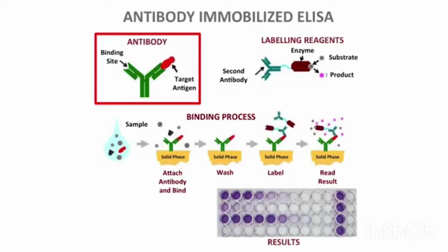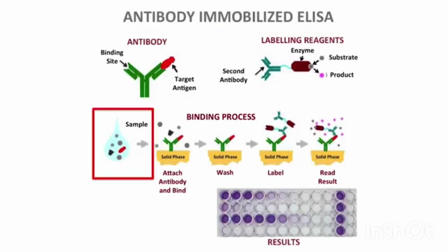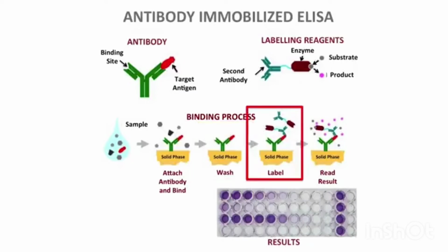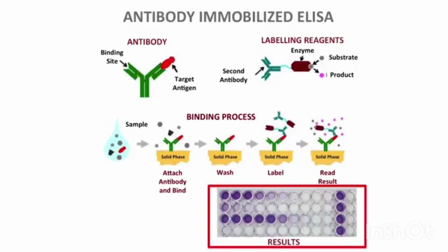So now we have our antibody, and you can see its target. We have a secondary antibody that's attached to an enzyme that takes substrate to a product that we can see. And so we have a sample that contains our antigen. We attach the antibody to the solid phase. This is the one where the antibody is attached. And we bind to the antigen that's in solution, and we wash away everything else. So all we've got left is our antibody and our antigen. And now we use a secondary antibody that's attached to an enzyme to bind to the antigen. You can also have another antibody that's bound to an antibody. This can be sandwiched in many different ways. We wash all the excess antibody away, and now we add our substrate and look for our product, and we can read our results and see where was the antigen that we were interested in.